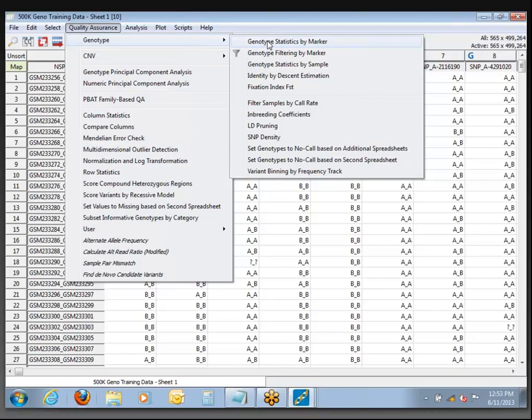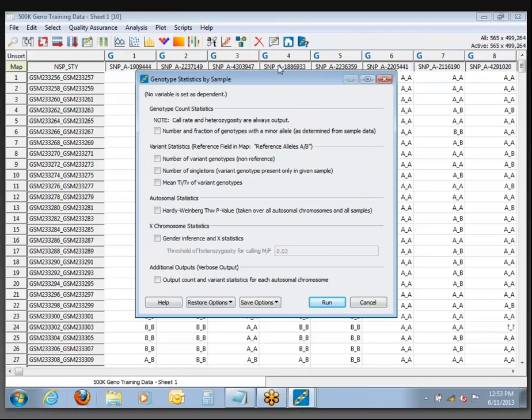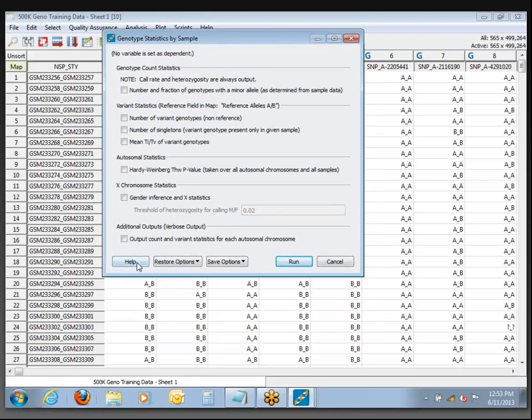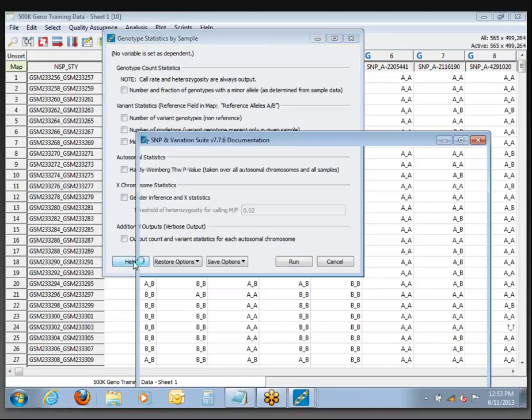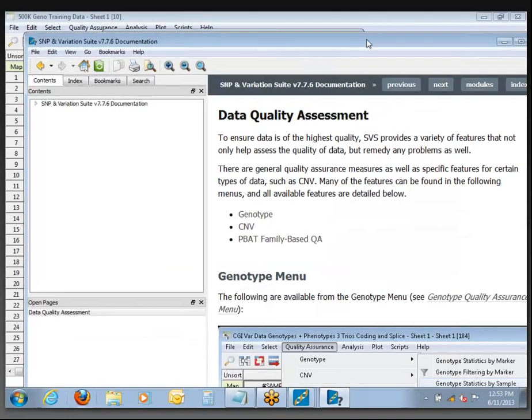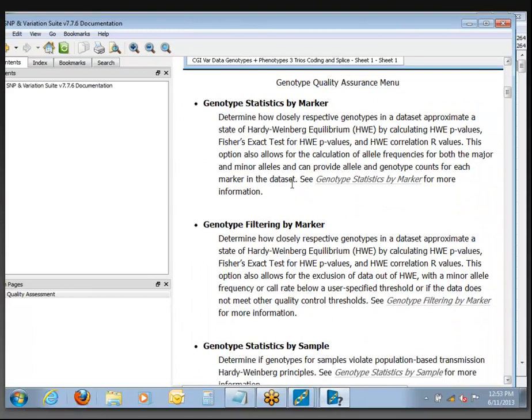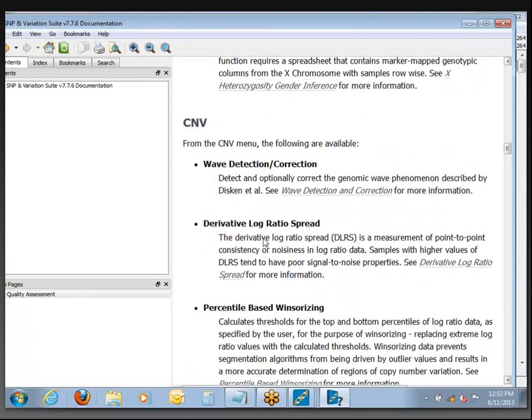In this menu we have a lot of choices available. Some are specific to sequencing data, some more specific to this type of GWAS data, so you need to pick and choose which options you want. You'll notice this Help button — in pretty much every function in the software you'll find this Help button, and when you click it, it will take you straight into the manual where you can read more about that particular menu and what all the different options mean.